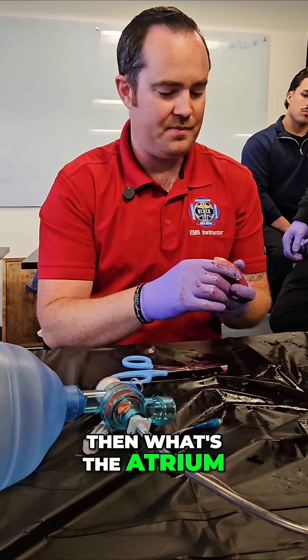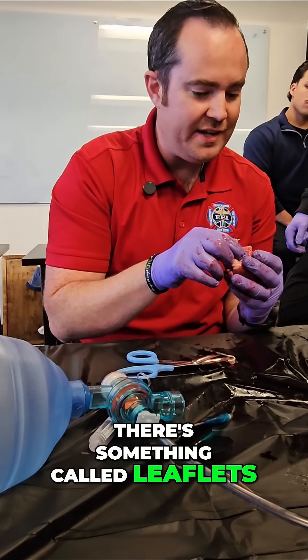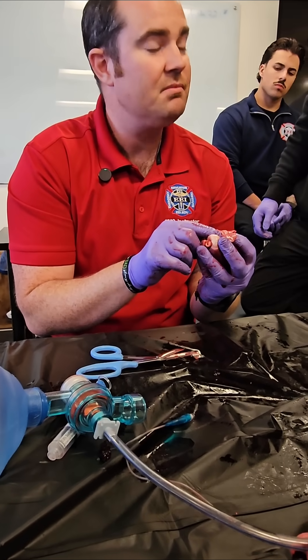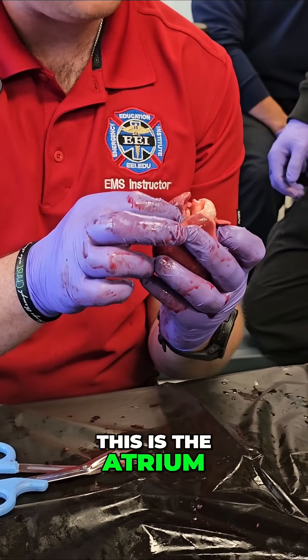Then what's the atrium? The atrium is here at the top. There's something called leaflets — do you see this little piece of tissue? That's the atrium. And this is the atrium.